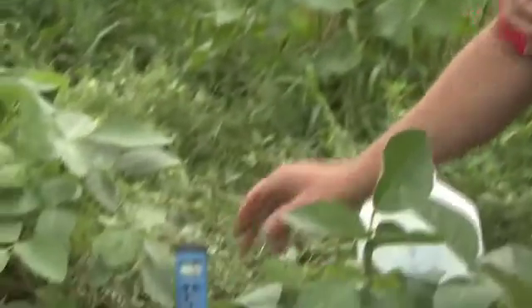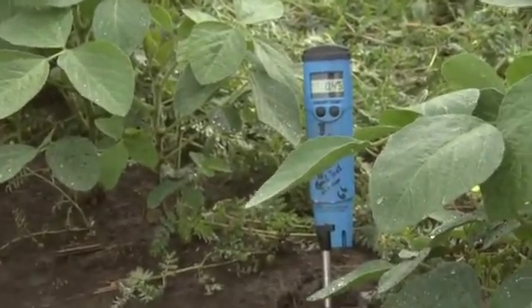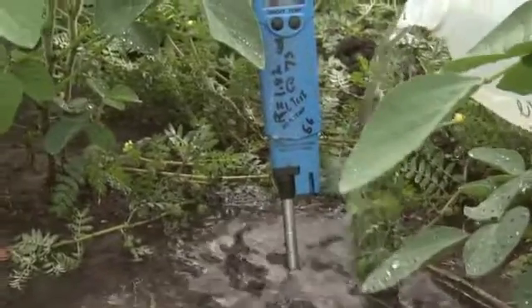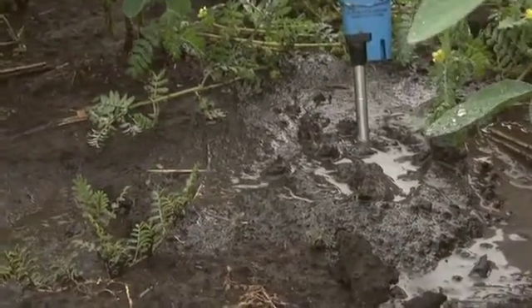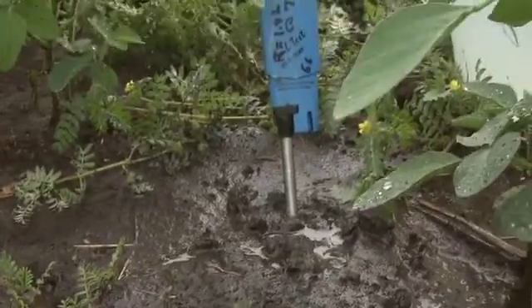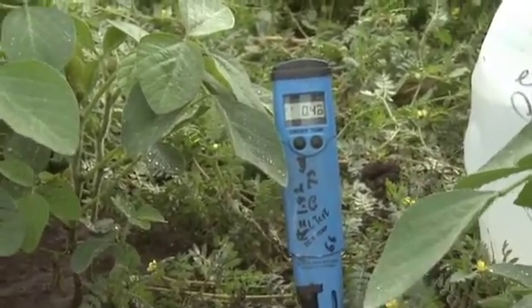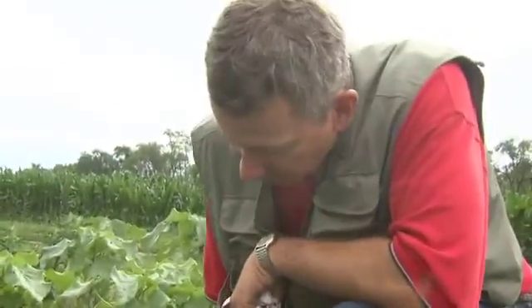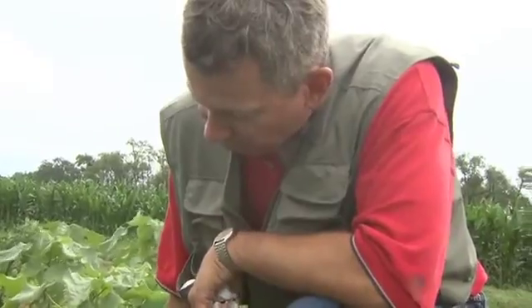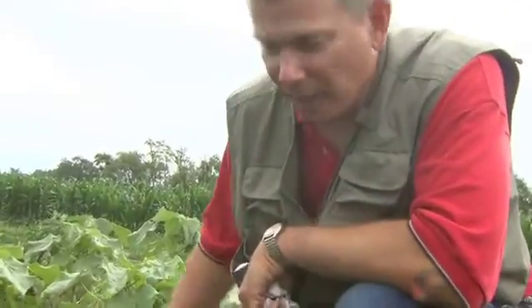The other part we can do is go ahead and do an infield estimate of EC, and this is in lieu of doing the one-to-one test with the vial we showed prior. You simply put the probe in, saturate the area with a canteen — in this case I have a milk jug of water — creating saturated soil conditions. If you remember, we read about 0.55 with the one-to-one, and here we're reading about 0.45 EC. This is a non-saline area; we could be picking up nitrates in the soil, possibly other nutrients such as sulfates — soluble nutrients showing up as a soluble salt. So this is a quick, easy way to compare it.